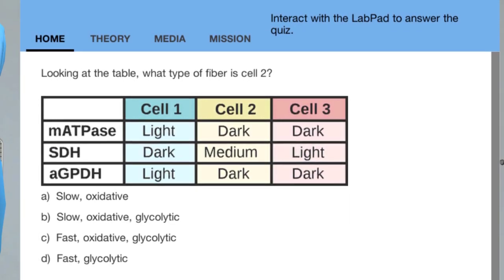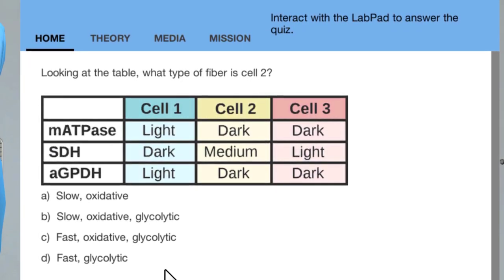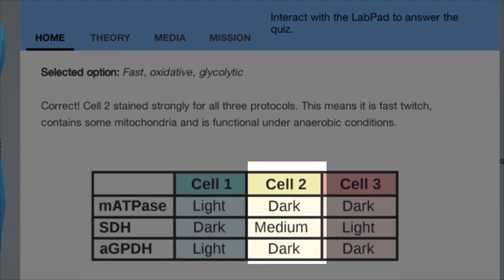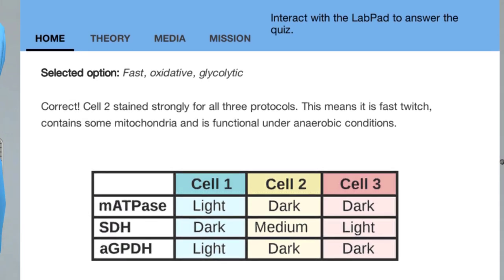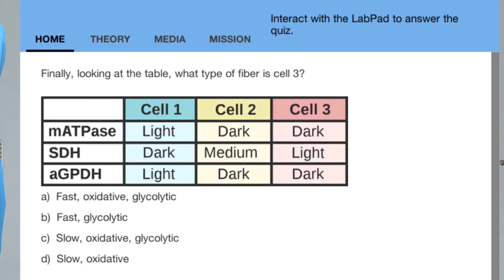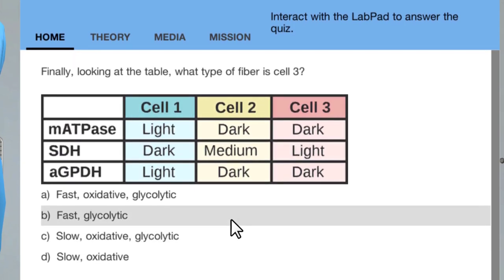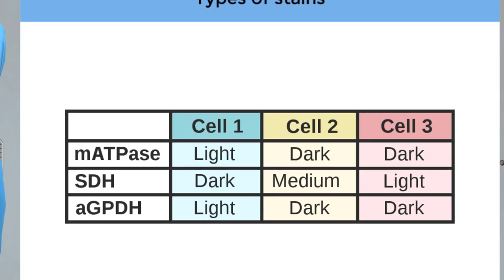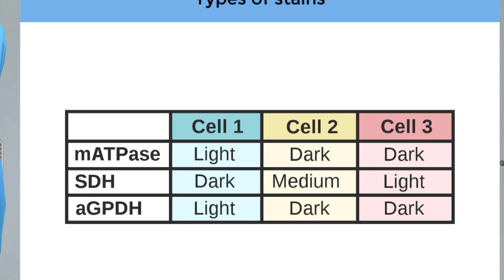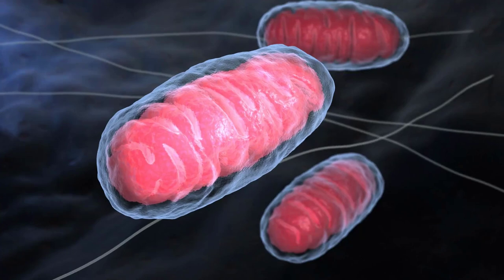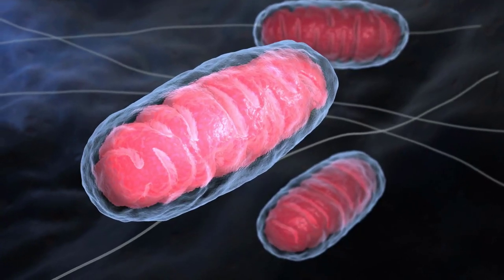Looking at the table, what type of fiber is cell 2? Correct, cell 2 stained strongly for all three protocols. This means it is fast-twitch, contains some mitochondria and is functional under anaerobic conditions. Finally, looking at the table, what type of fiber is cell 3? You've got this, cell 3 stained for both myosin ATPase and aGPDH, meaning it can convert ATP and work under anaerobic conditions well. However, it didn't stain much for SDH, meaning there are fewer mitochondria and it is non-oxidative. Great, now that you know how to analyze the assays, it's time to do some myosin ATPase staining of the soleus and EDL muscles you dissected and turned into thin sections.